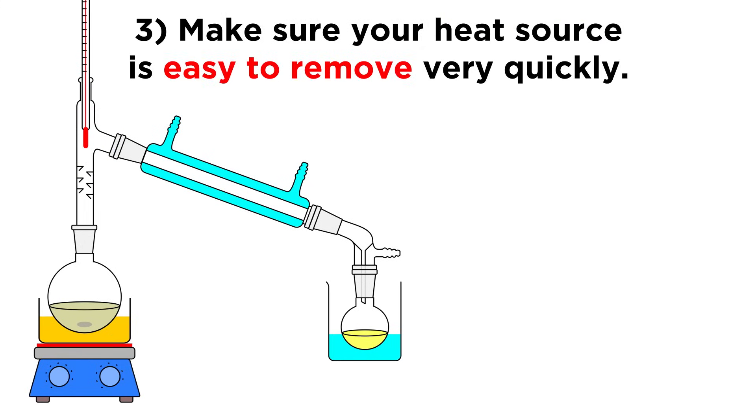Third, make sure your heat source is easy to remove very quickly. If it's a Bunsen burner, make sure the setup is such that you can just pull the burner away instantly. If a hot plate, make sure it's easy to loosen one clamp and pull things apart easily. It's possible for the mixture to suddenly begin boiling violently, and we need to remove the heat right away if that happens.